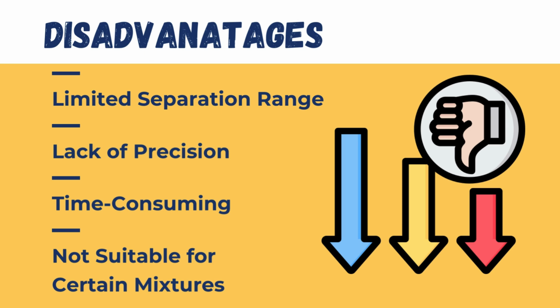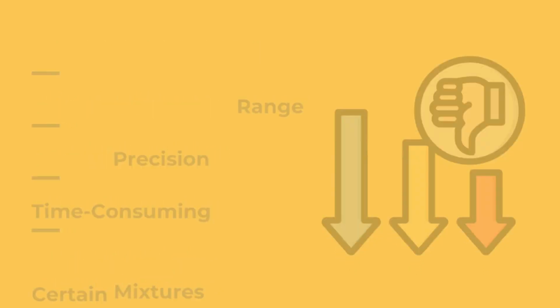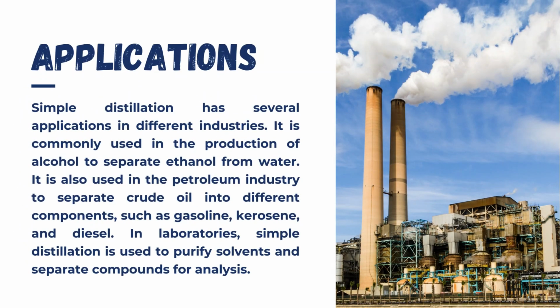Now guys, at last, for this video, we will be looking at the applications of simple distillation. Guys, you might all know that simple distillation is pretty handy in various fields. For example, take the making of alcohol. We also use it to pull out pure ethanol from water.